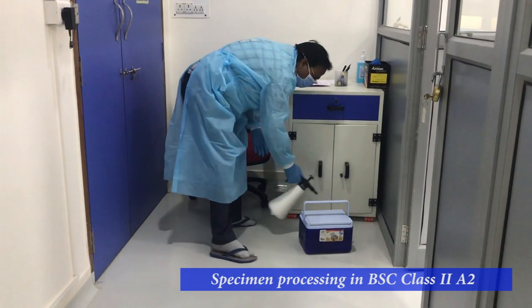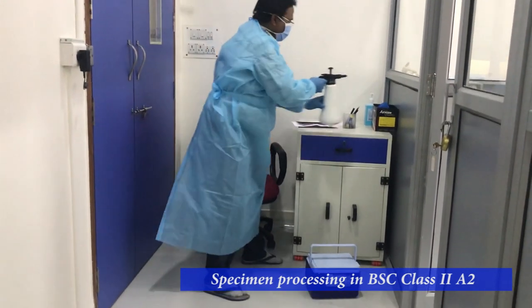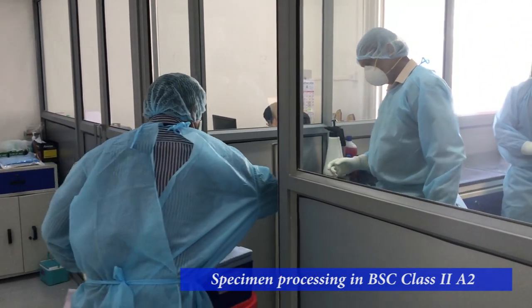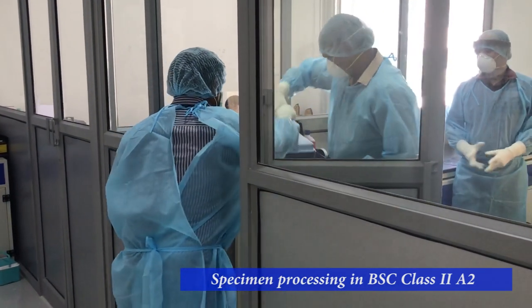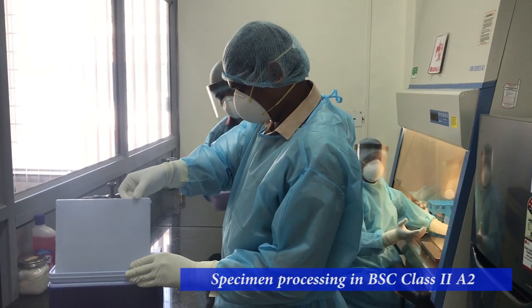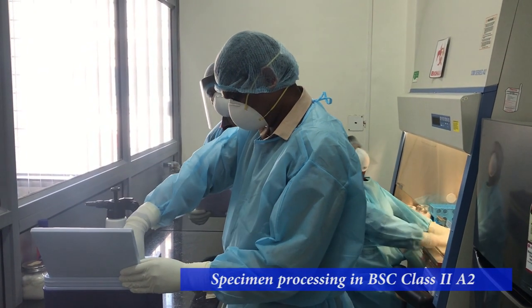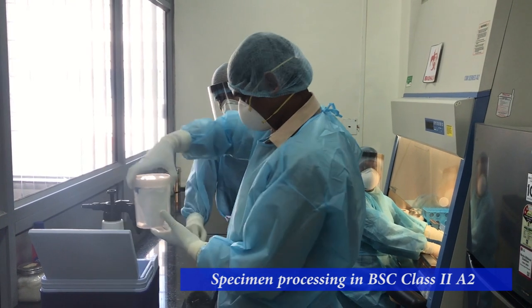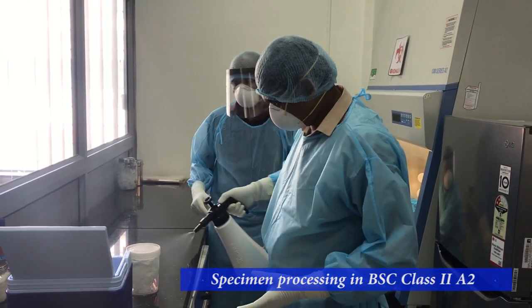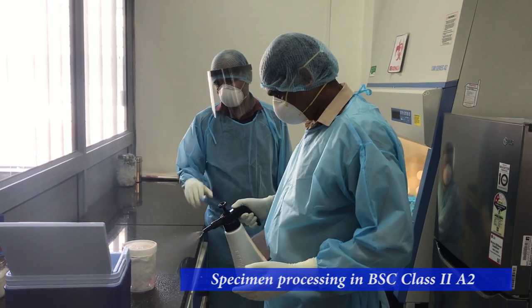The sample separation will be performed in a biosafety level 2 lab by personnel in full PPE inside a validated and certified biosafety cabinet class 2A2. After removal of the secondary container from the vaccine carrier, disinfect the container and hand it over to the staff separating the specimens.